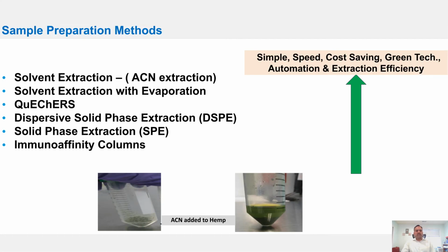Now I'm going to switch gears and talk about the sample preparation method we used to analyze both pesticides and mycotoxins from hemp matrix using our LC-MS method.